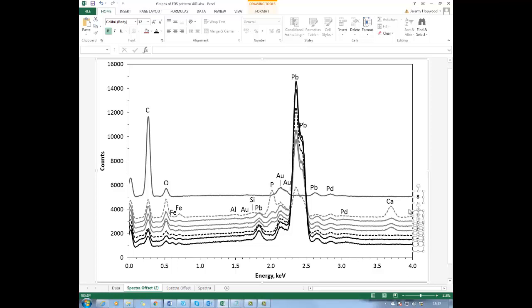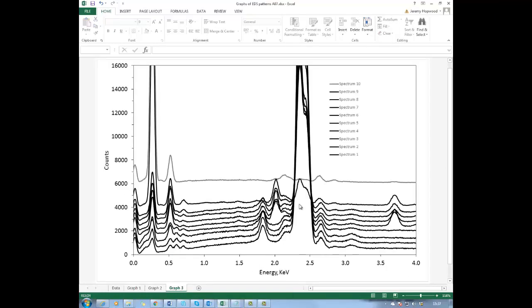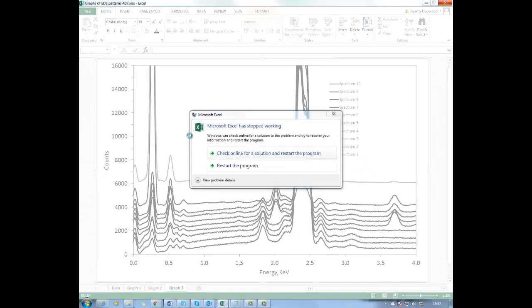It does. Control C, go back to my other one, Control V. Oh, didn't like that at all. Oh, no. Right.